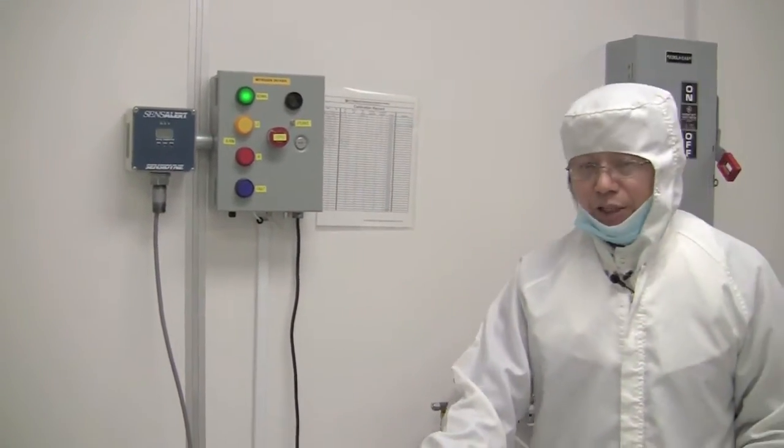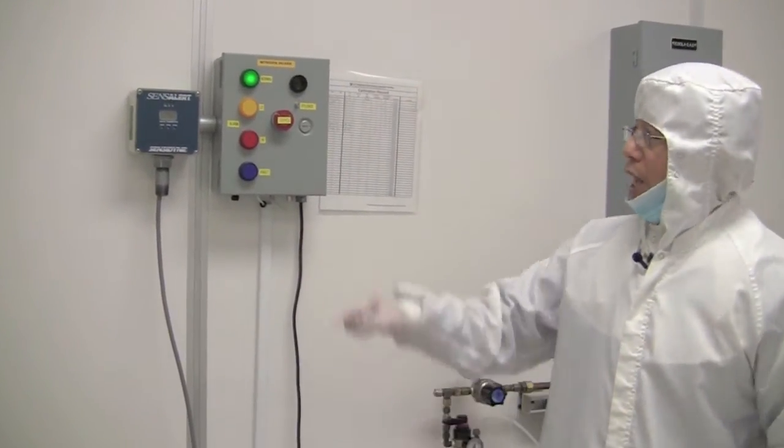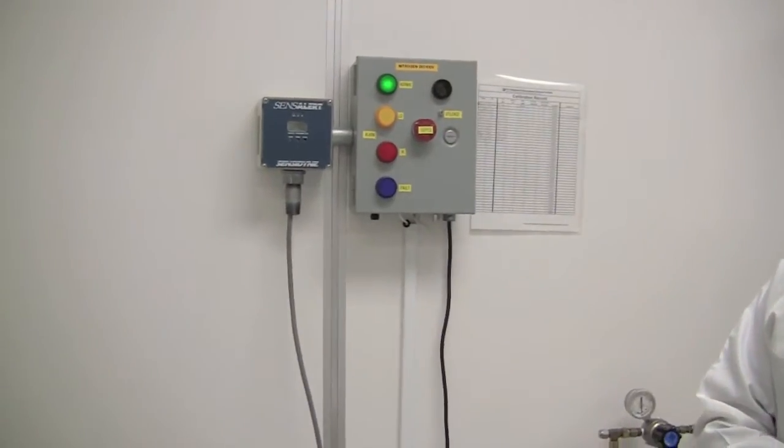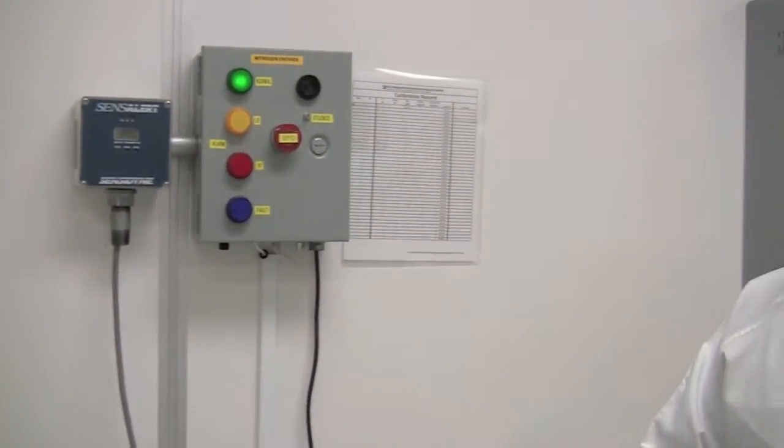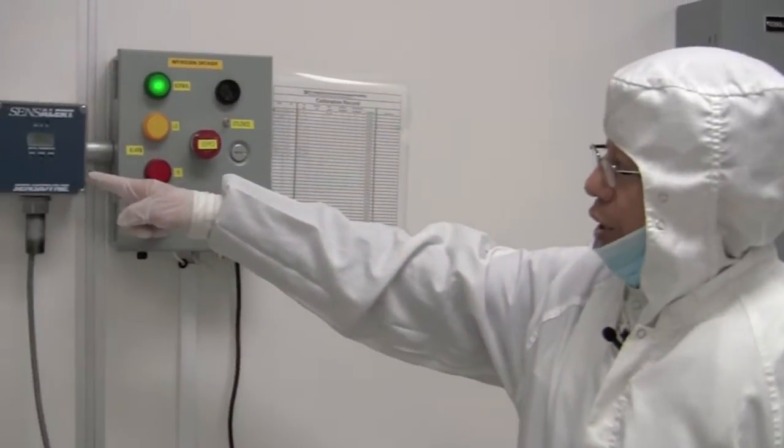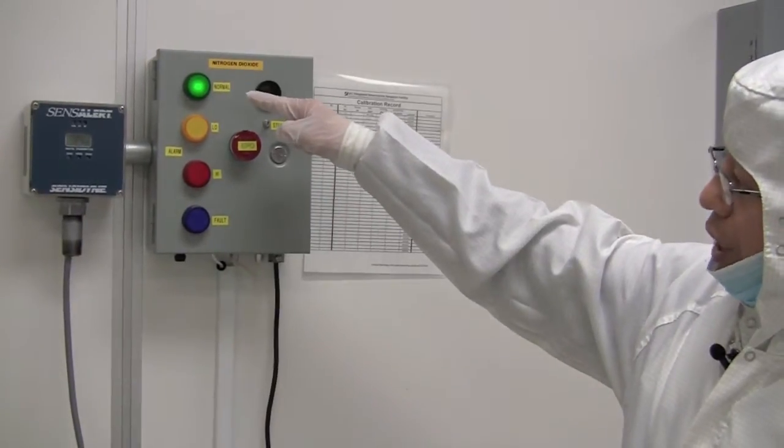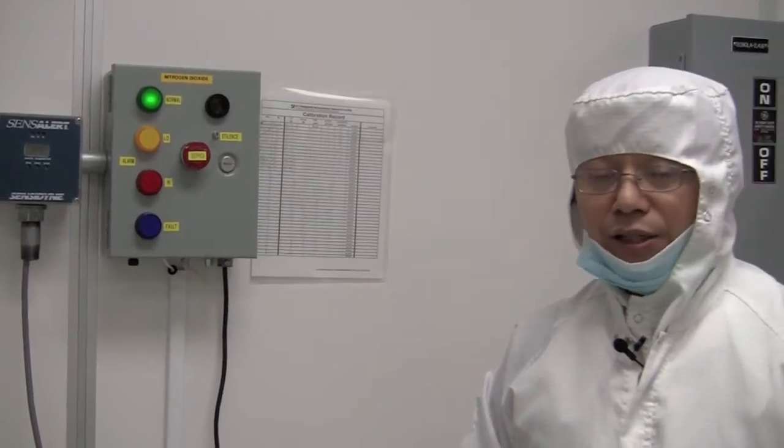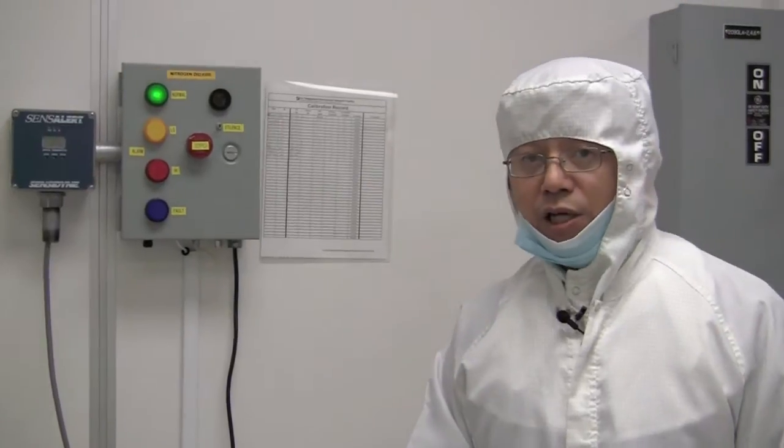Inside the cabinet, we also have nitrogen dioxide, which is hazardous. So we have a detector here. Make sure the green light is on. If the red light is on, you should immediately exit the clean room and inform the staff.